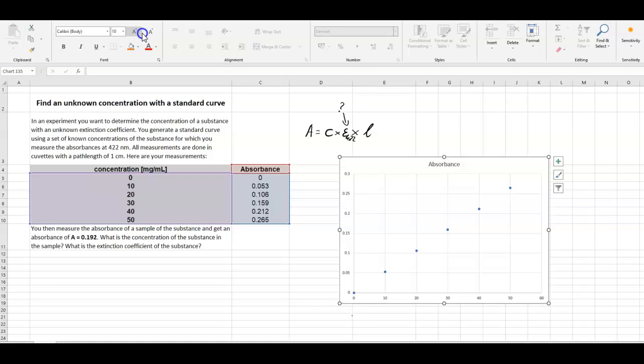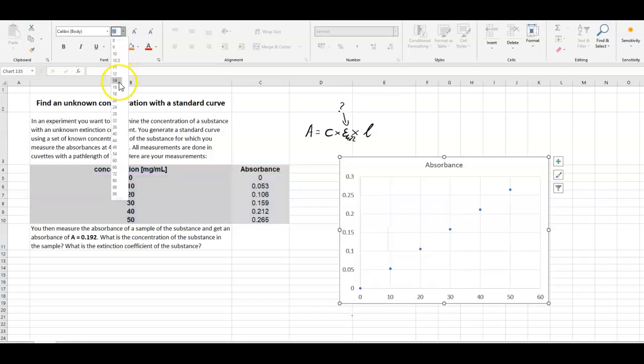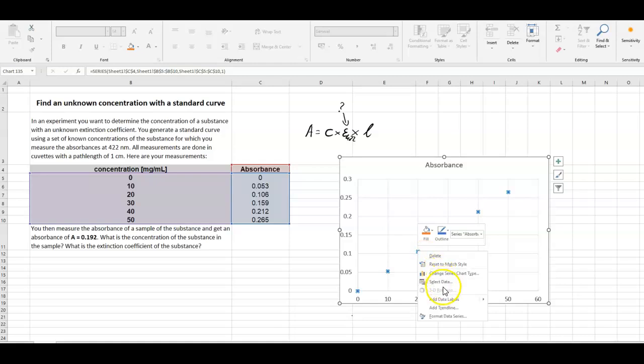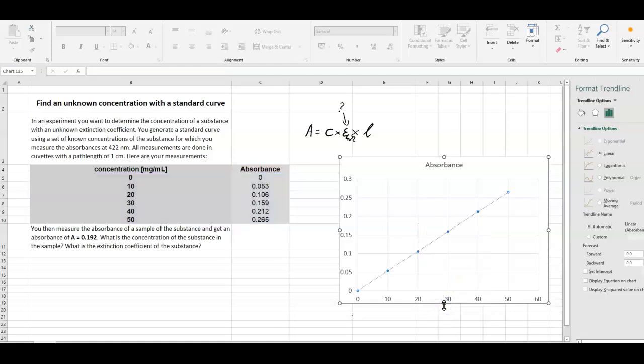Let's see if we can make the text a little bit larger. So, yep, so that's our text. Next, we can do a sort of a trend line, but it looks pretty much a straight line here. Let's quickly do the trend line. So we add a trend line and we want the equation and also the R square value.